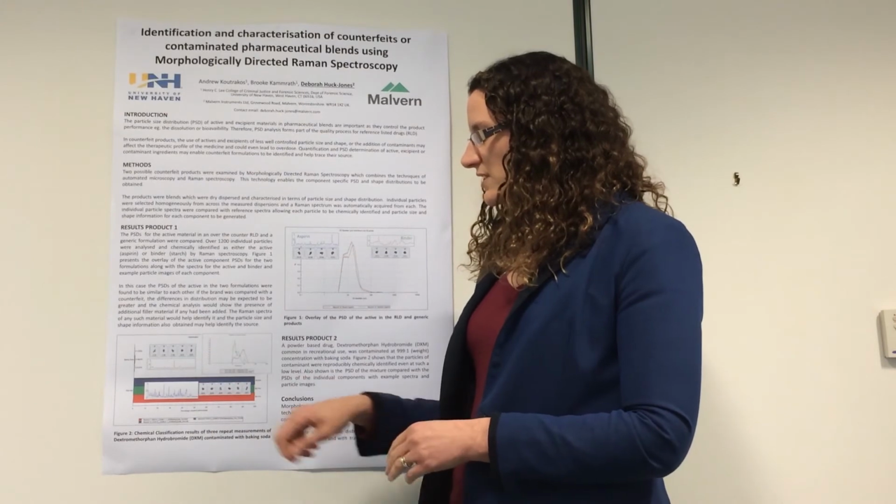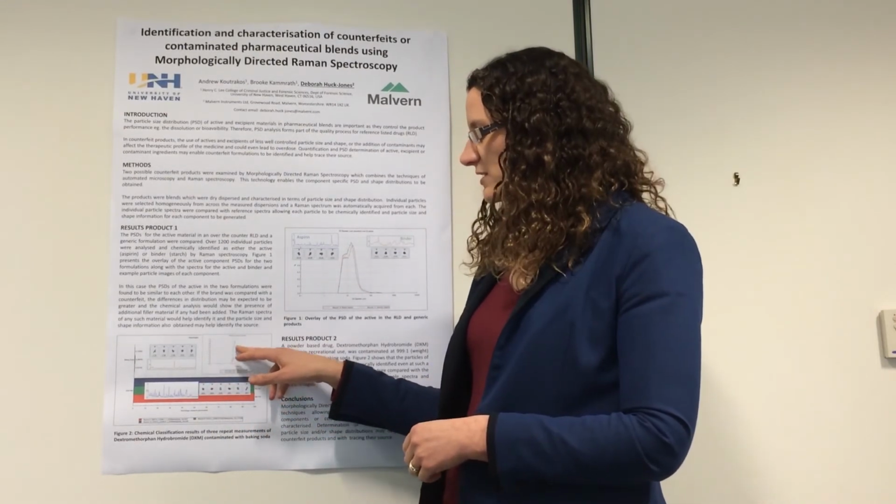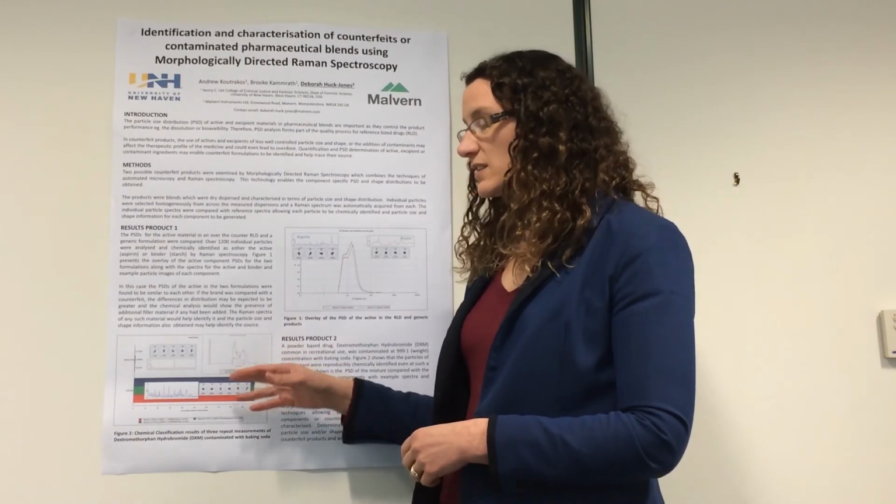We're also able to distinguish these particles separately from the bulk, and here we have a size distribution of just the contaminant particles that tells us generally it's smaller than the rest of the material present.